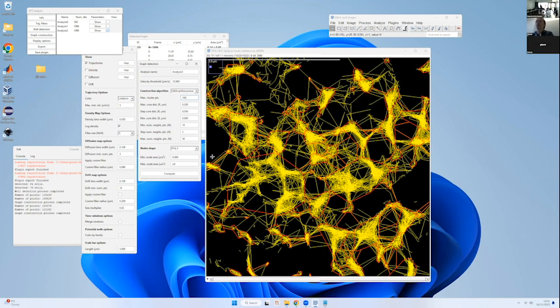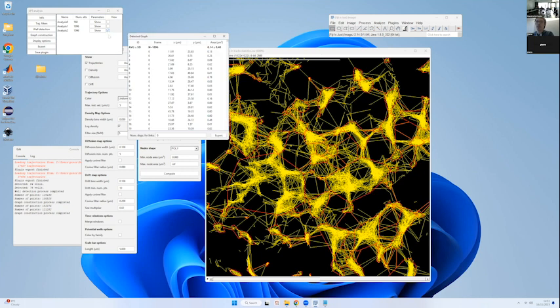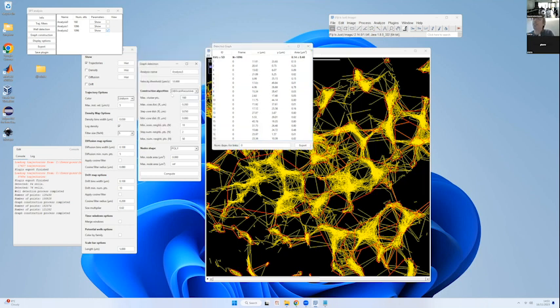We could run it, but okay, it's not super important. So yeah, one more time. What do you need to change in the recursion? In the construction algorithm, in the induction of several dbScans, what are the parameters you have to change? In the recursive? Yes. So here I would do 7.